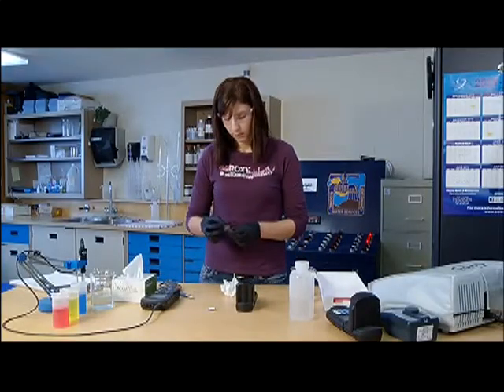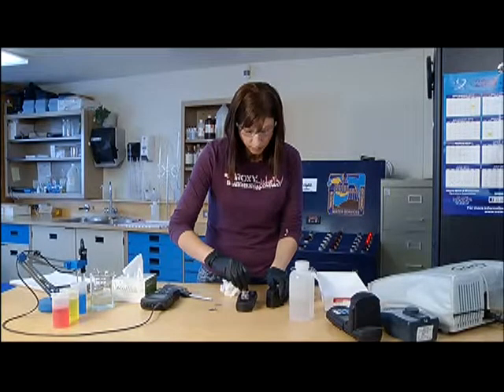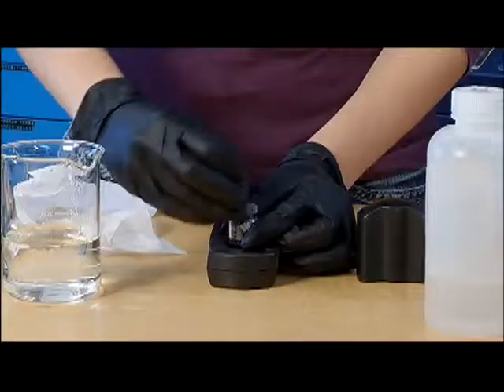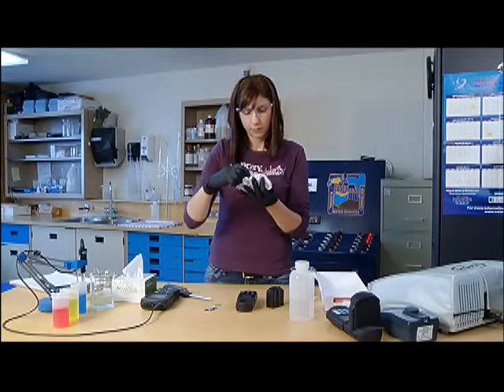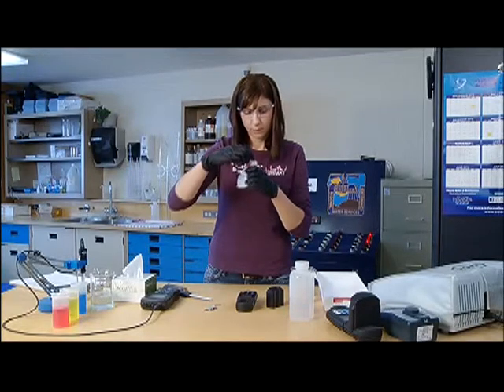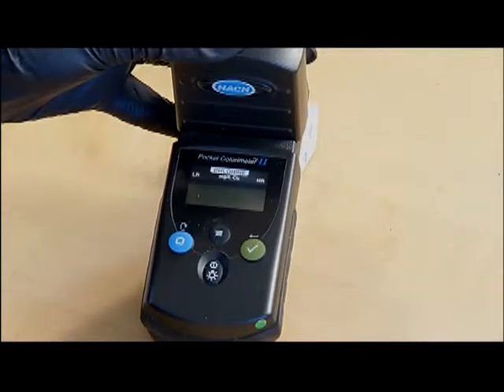Put the uncolored sample into the colorimeter and zero the sample. Add the second package of reagent, replace the lid, and stir. Remove any exterior contamination and return the vial to the instrument. Read the results and record in the appropriate logs.